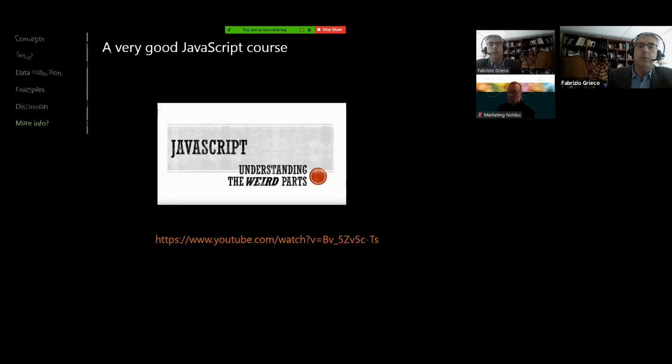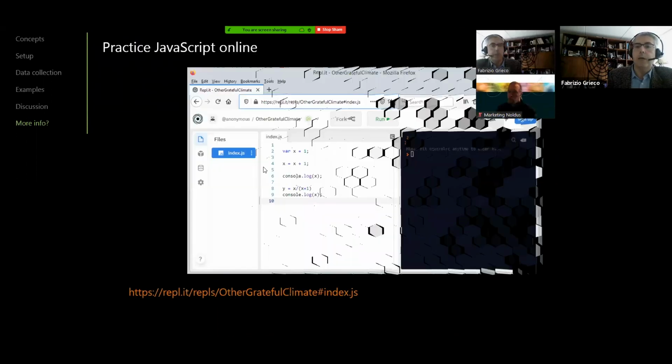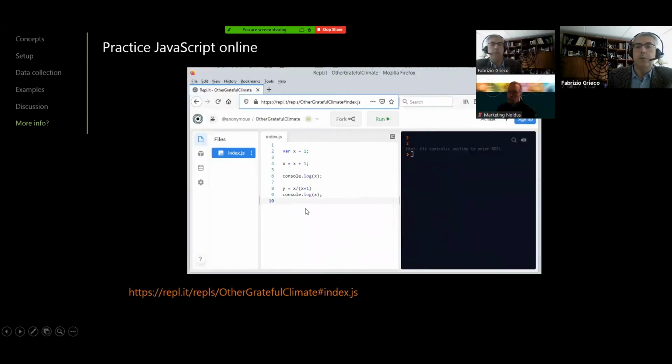And if you want to practice with JavaScript outside EthoVision, there are some online consoles that you can use to practice with simple functions, like in this case. This is just one I encountered, but probably there are many.